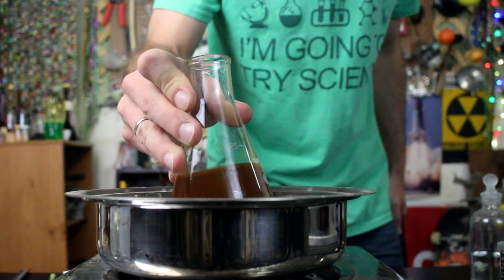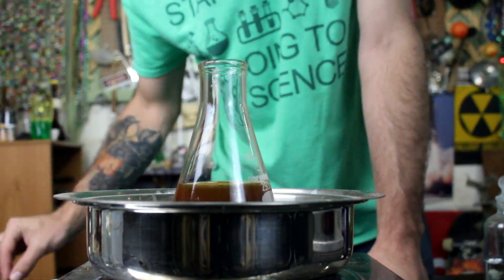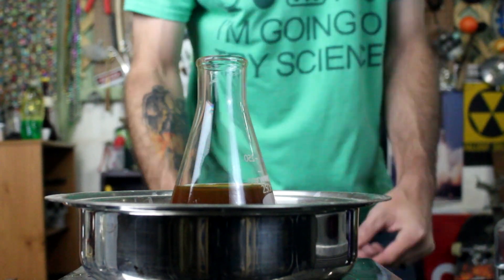What we're left with is a pretty funky looking solution of iron 3-chloride. Now ideally we should be able to boil this off and be left with a nice product.